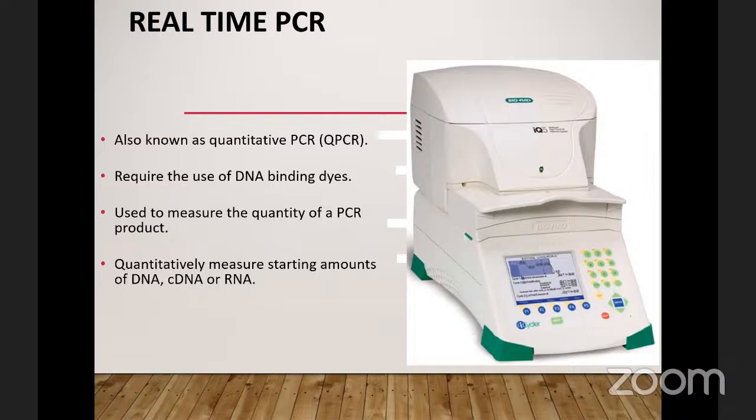The topic of this module is actually PCR and its application in molecular diagnosis and monitoring. So we are not just interested in diagnosis, but monitoring. Let's say a person comes for a test and you have quantified the DNA, you have a particular value, and then this person goes on treatment for say 7 days, 21 days, or whatever, and then another sample is sent to you. You should be able to tell whether there is an improvement, you know. So this is where real-time PCR comes in. Next slide.